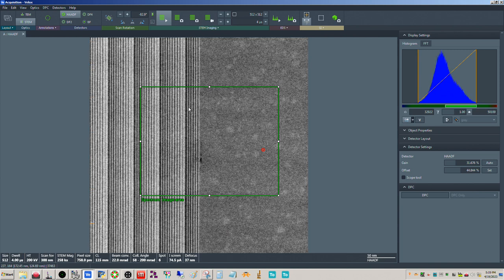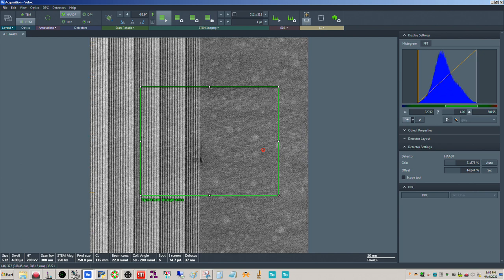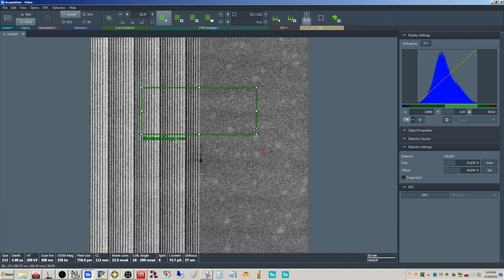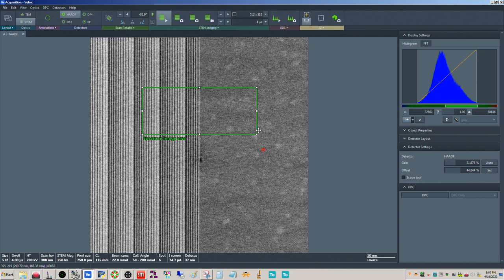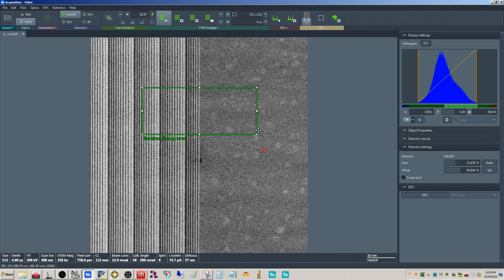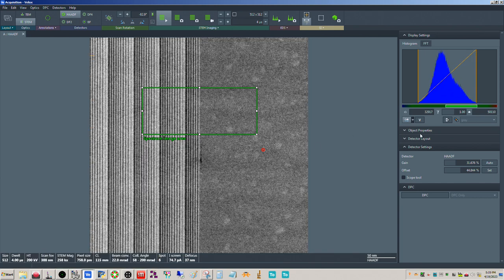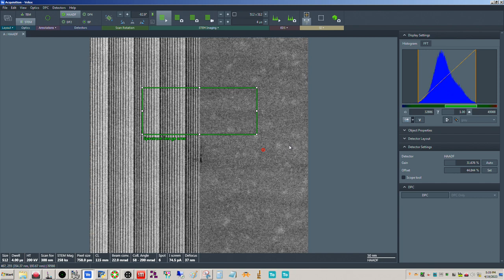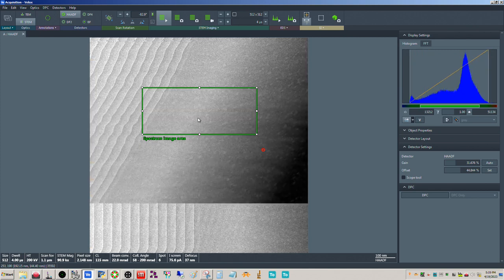If I wanted to just map these quantum well structures, and maybe map something like this, using nanoprobe mode is kind of unnecessary, almost, and a little bit of overkill to do that. My opinion is that you only really need to use nanoprobe mode on a corrected tool when you're doing atomic res mapping.